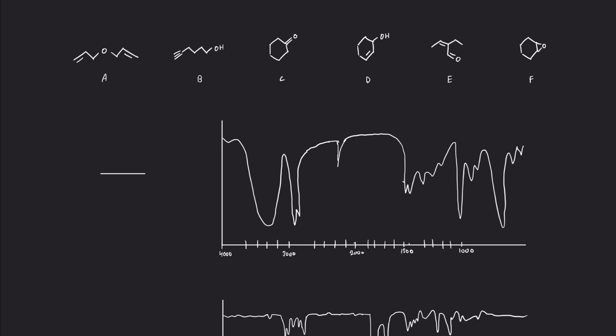we can see that there's a very obvious hydroxyl stretch, and I'll label it right here. So these hydroxyl stretches usually occur around 3,300. They usually are broad. So as you can see, this is pretty broad. So a broad, big stretch, it's usually a good indicator that you have an alcohol group. Around the 2,900 range, where my arrow is, this is the sp3 CH bond. You'll see this with every IR graph most of the time. It'll appear different sometimes, but this will always be there.